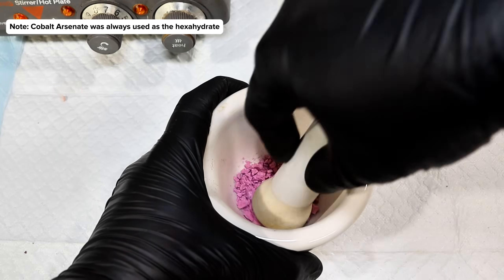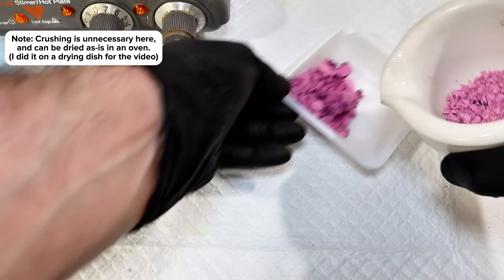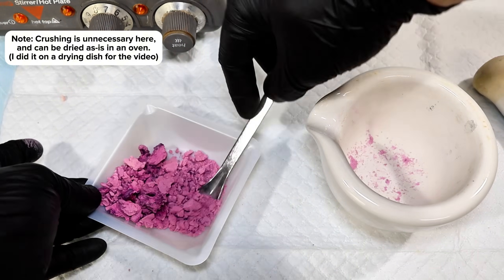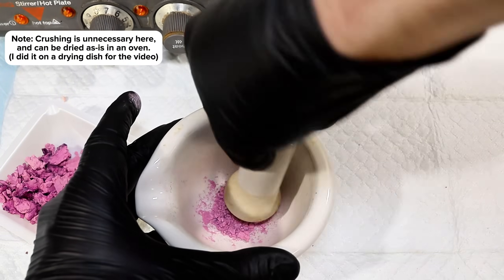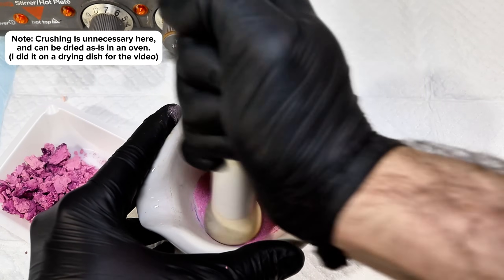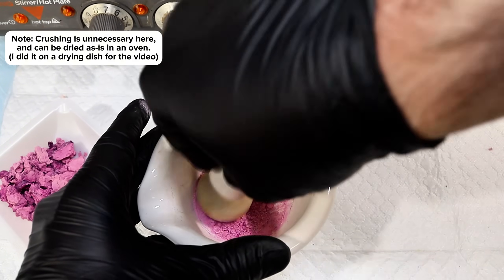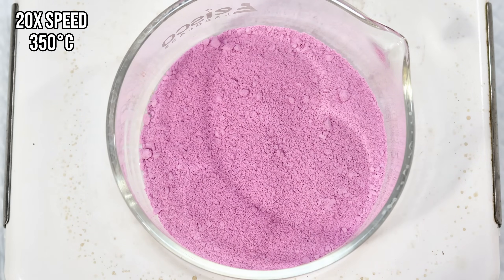To dehydrate cobalt ammonium phosphate hexahydrate to its anhydrous form, I began by simply crushing it up into a mostly uniform pink powder. This stuff is a whole lot more durable than it looks, and so this actually took a good deal of effort. Once I had finally crushed it up as finely as I could manage, I simply transferred the powder to a borosilicate glass dish and placed it on my hot plate.